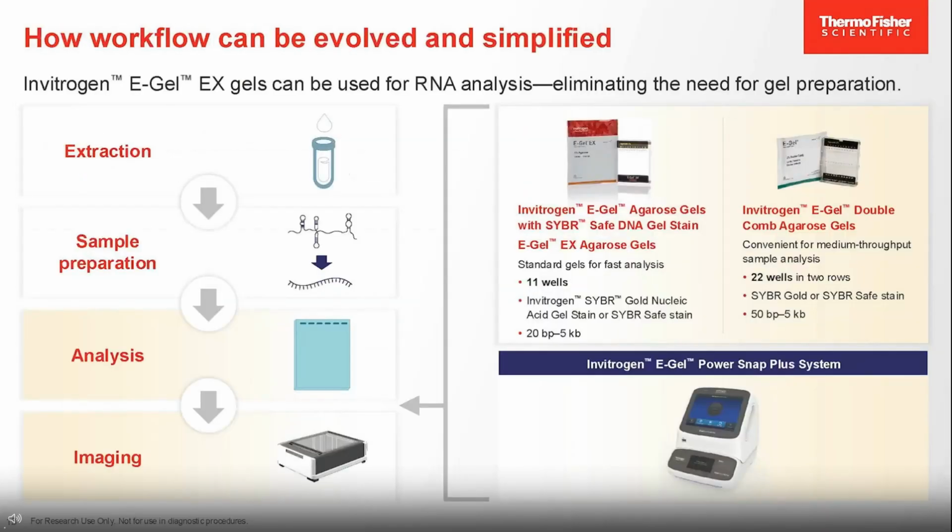So how has the workflow evolved and how can it be simplified? As mentioned, I'm not going to cover the extraction because extraction protocols really depend on your end application and what your sample is. The sample preparation is really not that big of a time consumer, because we can prepare your sample in at least 5 minutes, depending on your denaturation conditions. But the analysis and imaging workflows, where you have to either prepare your gel and then run it, are the big time consumers within all of the electrophoresis workflows.